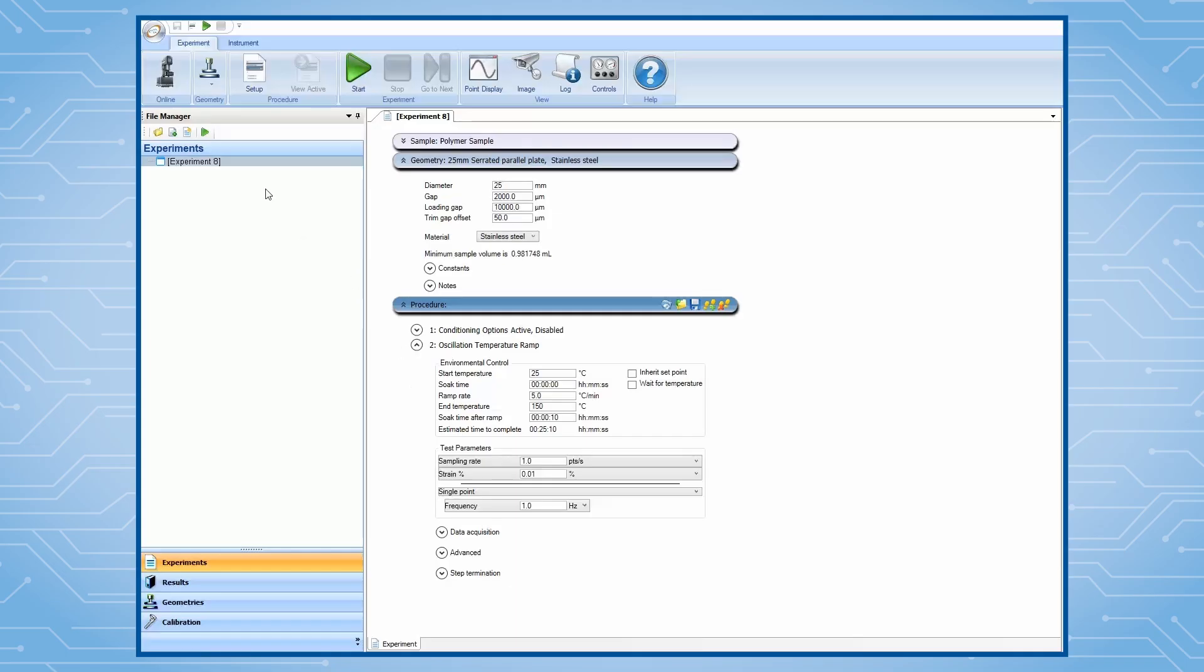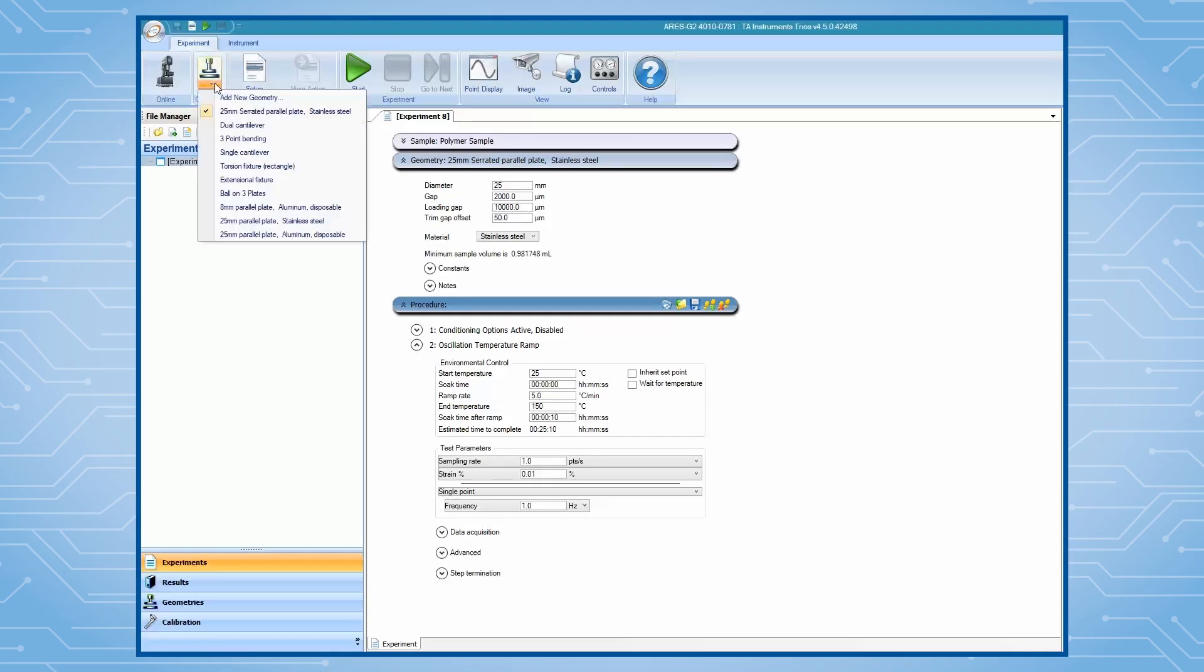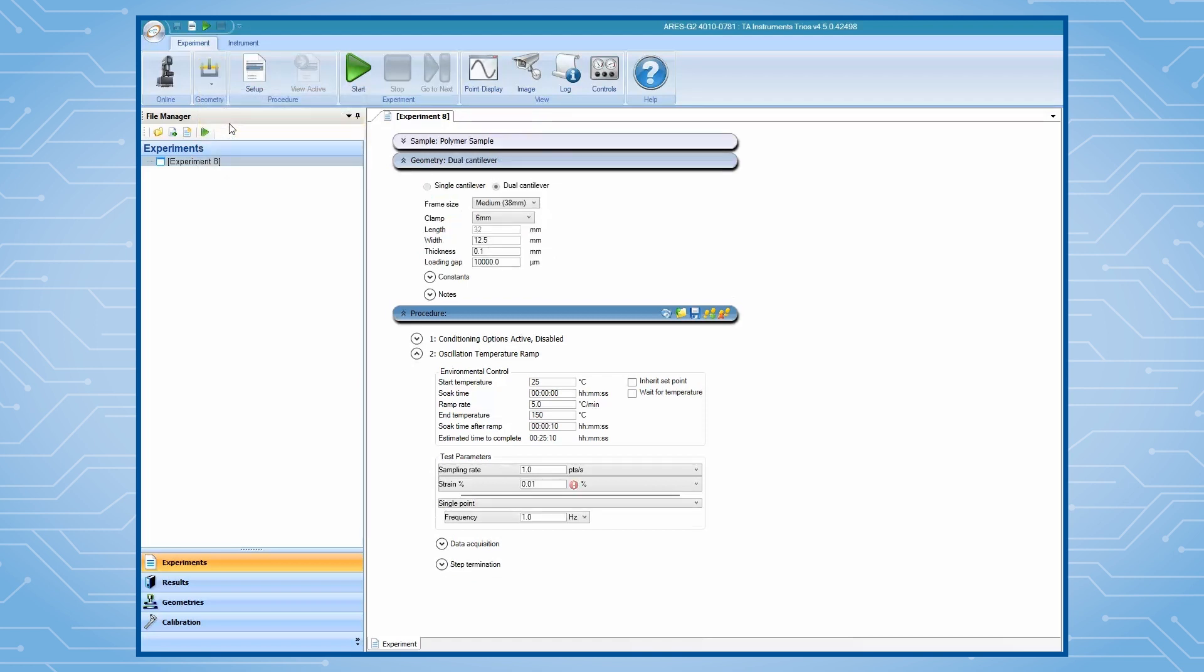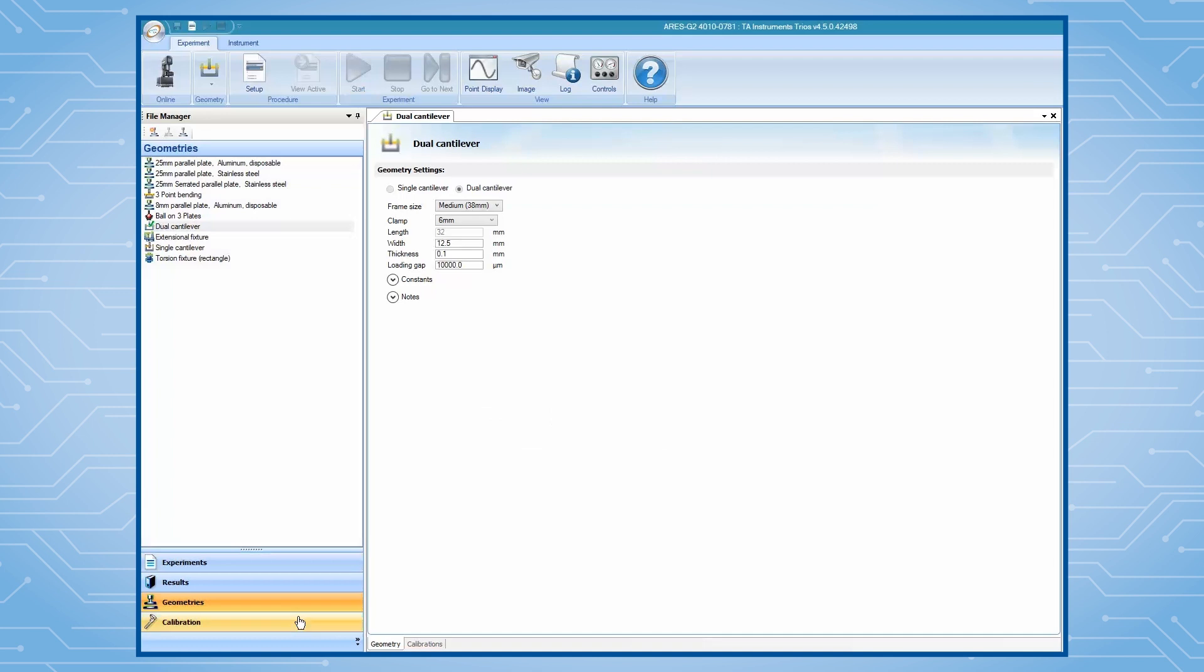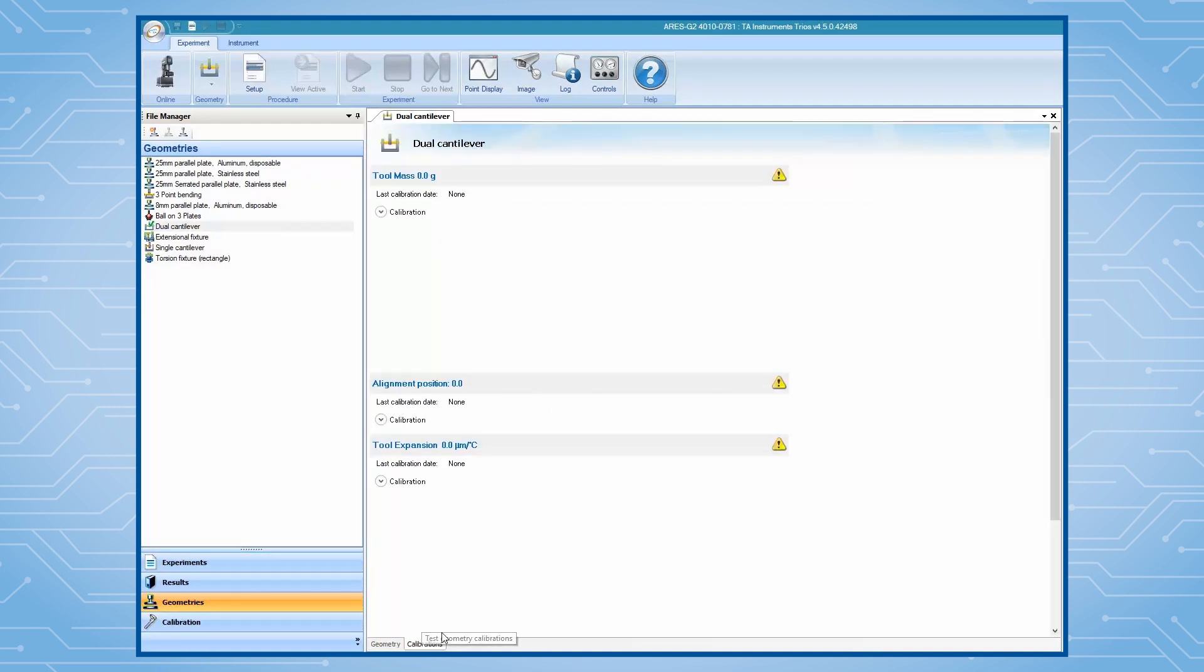From TRIO software, select single or dual cantilever from the geometry drop-down menu. Then proceed to the clamp calibration.